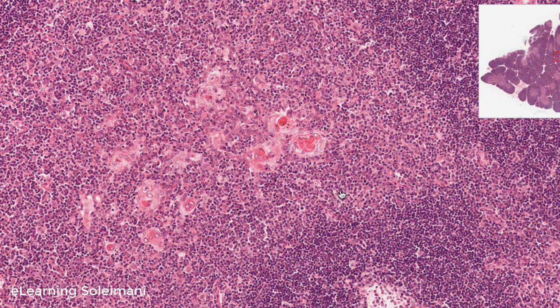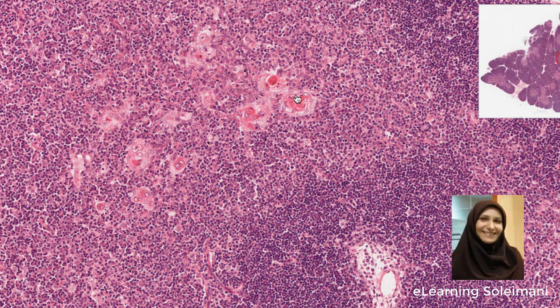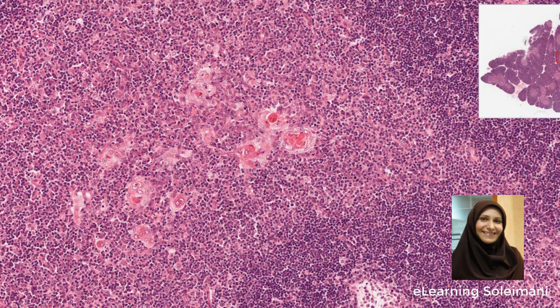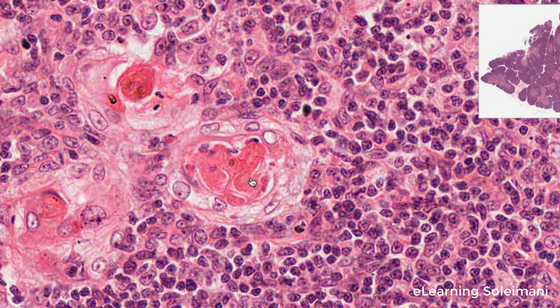In the medulla, we see a landmark to help us identify the thymus, named the Hassall's corpuscles. The Hassall's corpuscle is comprised of an aggregation of epithelio-reticular cells that make up the stroma of the thymus. These aggregates are visible as concentric circles in a thymus cross-section, similar to an onion cross-section, and they are called the Hassall's corpuscles. The Hassall's corpuscles affect the final differentiation of T lymphocytes.